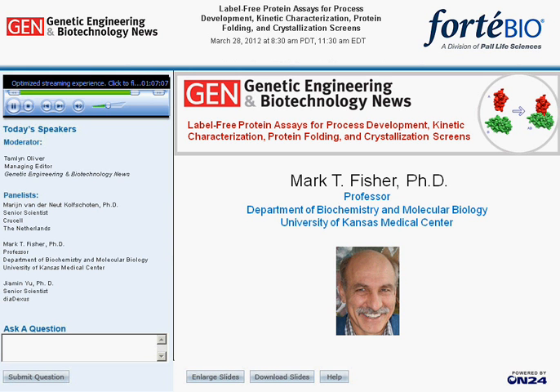We initially observed this with some early experiments that we published in Nature Structural Biology in 2008, where we could actually observe the EM structure of the anthrax toxin pore. In this particular case, we did not have to have any membrane present to observe that.